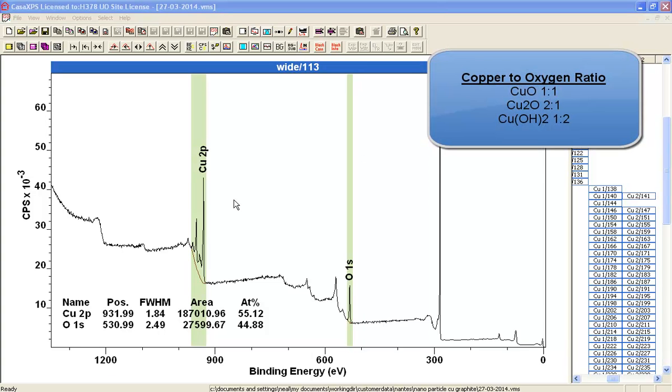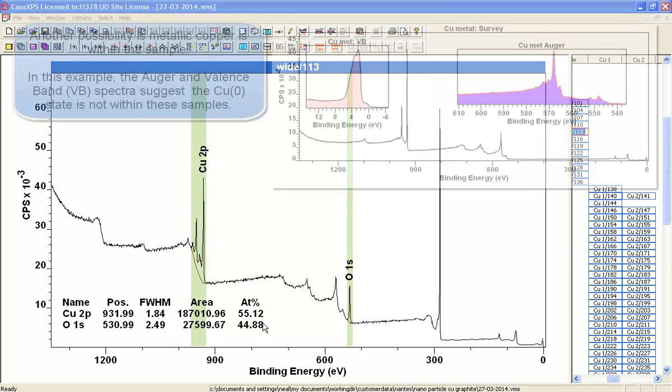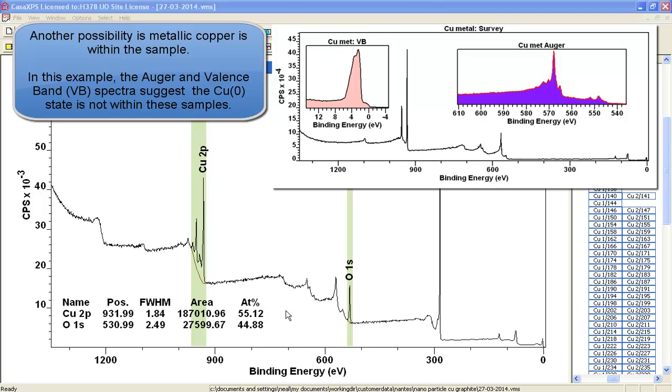When looking at copper oxide, one of the tests you could perform is to look at the ratio of the copper 2p against the oxygen 1s. And if properly quantified using relative sensitivity factors, transmission, etc., you might expect the atomic concentration to give an indication of the amount of each substance. In this case, we're looking at a material where it's slightly favoring the copper, but roughly about the same.